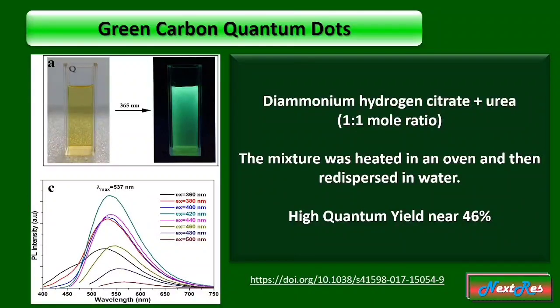It was found that the obtained quantum dots had a quantum yield near 46%, which is a really good percentage when talking about quantum yield.